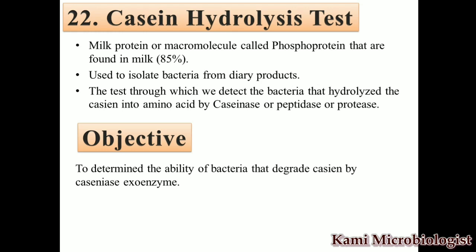It is actually the macromolecule that is mostly found in the milk, and it is available 85% in the milk. Now this type of test is specially used to isolate bacteria from dairy products.